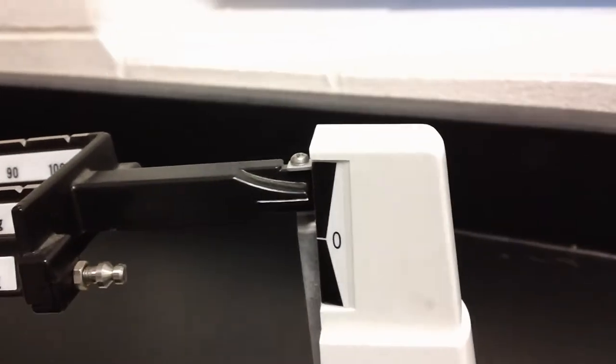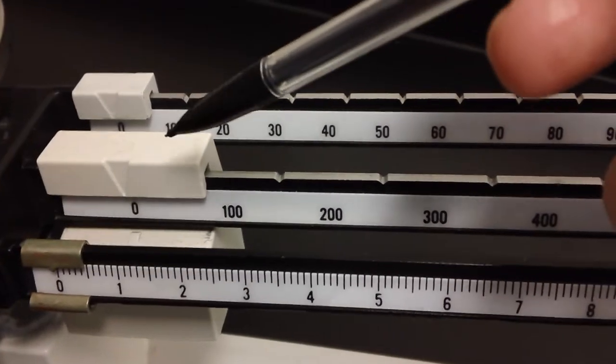What we're going to do now is we're going to use these counter masses in order to try to get this back to zero. That's our goal, to get this back to zero, and once we do, we'll count up how much of these counter masses that we had to use.